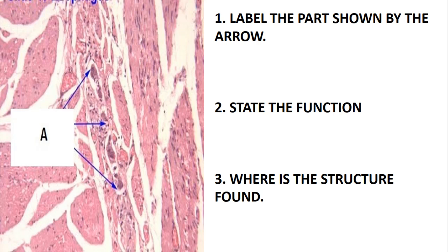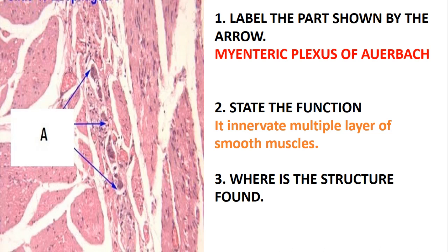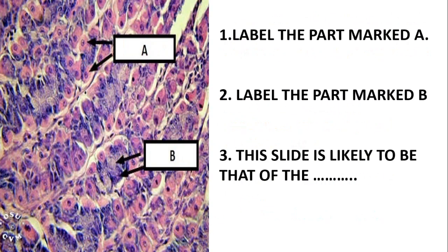Label the part shown by the arrow, which is the lymphatic nodule known as Peyer's patches. Moving on — this next slide shows a nerve structure, existing between the longitudinal and circular muscle layers. This is just the myenteric plexus of Auerbach. Its function is to innervate multiple layers of smooth muscle, and this structure is mostly found in the gastrointestinal tract.